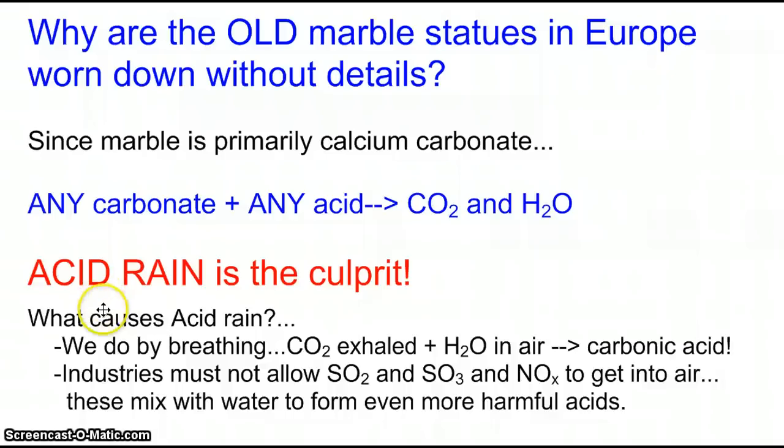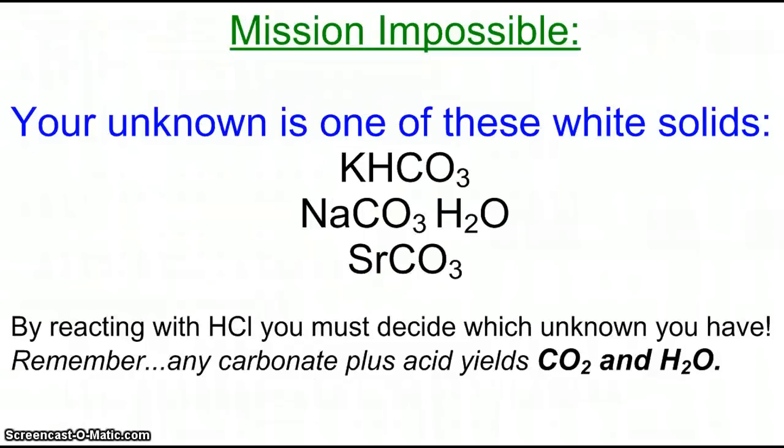So your lab will actually be, you will be given a solid unknown. It will be a white solid in every case, and your task will be to figure out the identity of your unknown by reacting it with hydrochloric acid.